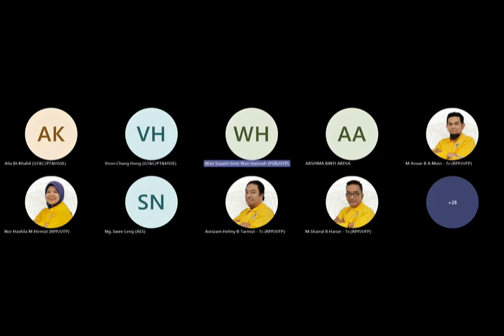It's actually unknown. But I tried to search for the common aurum concentration range in some clay or soil. It's maybe less than 10 ppm, less than 5 ppm. So it's very low, because we need to do the digestion first, and that will also cause a dilution factor and reduce the concentration more. Is there any way for me to find a method to detect it in ICP?